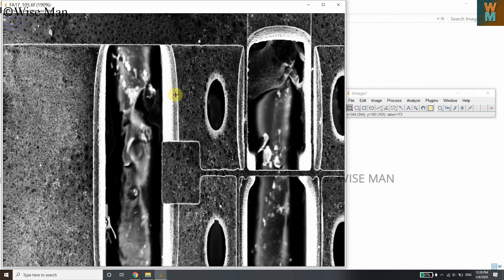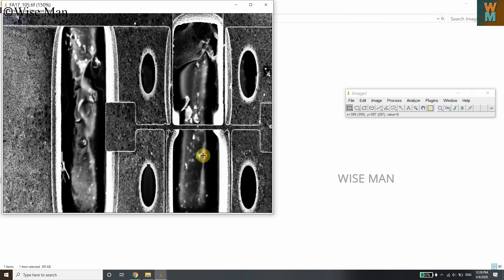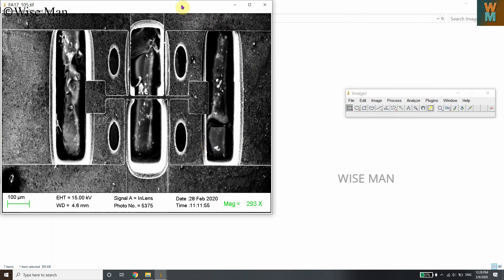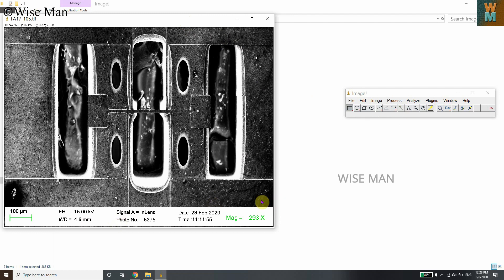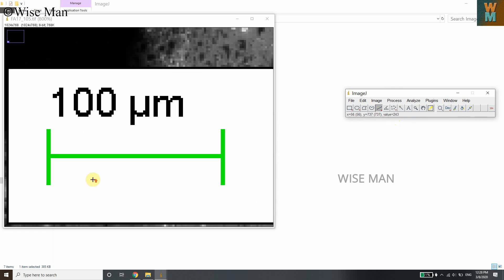To zoom in or out, hold the Control button and scroll the mouse wheel. Now, click on the Line button in the toolbar. If you right-click on it, you'll see options: straight line, segmented line, freehand line, and arrow tool. Select the straight line.